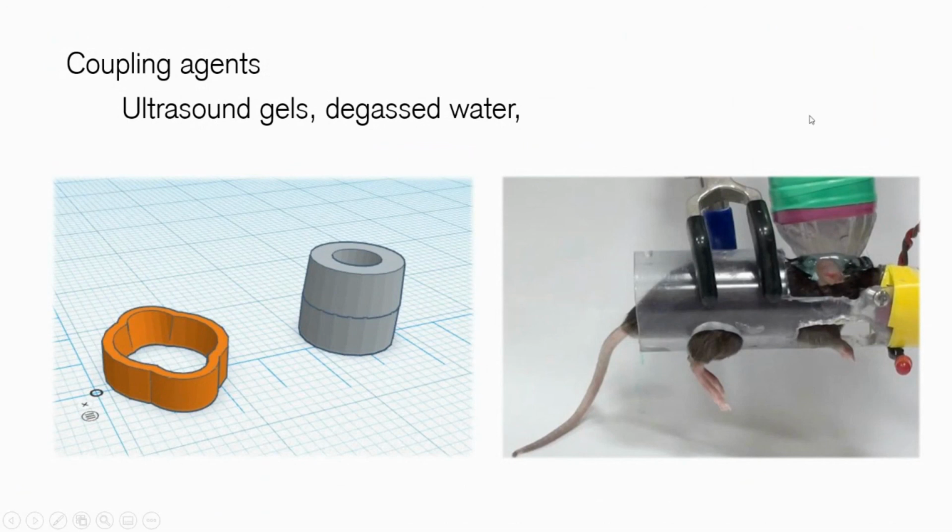If you have a really big transducer, so this is from Kim's lab, showing one of her preps, you can do something like creating a little water sac, filling it with degassed water, and smushing this against the head, and then put some ultrasound gel in there. But again, you don't have to be scared about how good the coupling is. At first, I would experiment and try to measure whether you're getting ultrasonic coupling using a hydrophone and an extracted skull. But be creative, there's a million ways to do this. Obviously, it's going to change depending on what experiment you're doing.